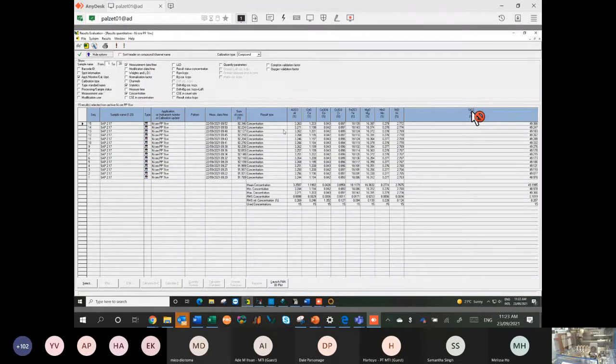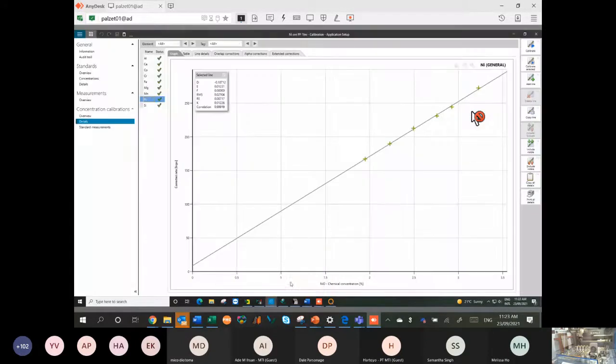And results can be obtained in bulk, in a bunch, as you can see here. Now, if you're used to the Axios platform, then these are very, very similar. So it's a very similar platform as the Axios. Okay, I think probably I might stop the session here. I might open for questions because we are almost out of time.